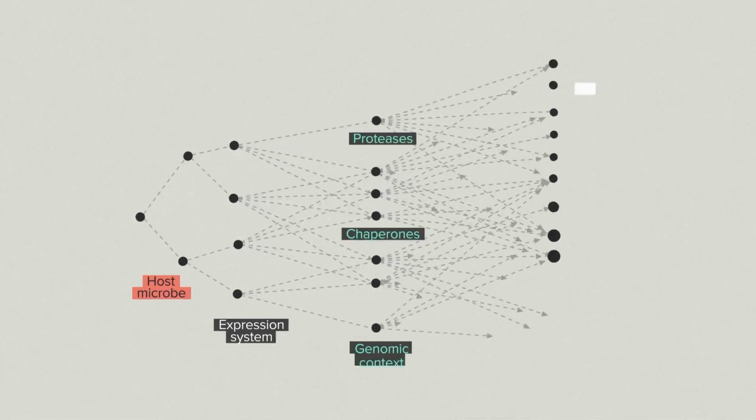This is the ground truth for strain performance. It's common for strains that do well in early development to perform poorly in bioreactors and vice versa. You need the high throughput screening to find the best strains and the bioreactor arrays to ensure that top performers truly perform. Every new branch optimizes for a different piece of the overall design.